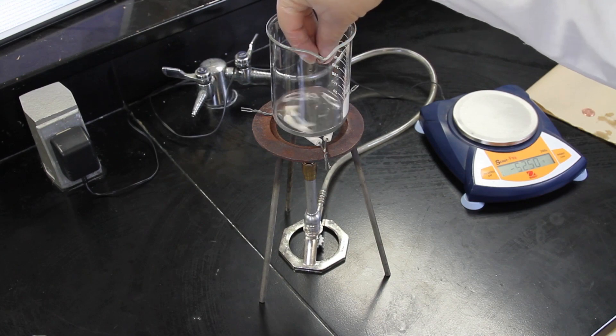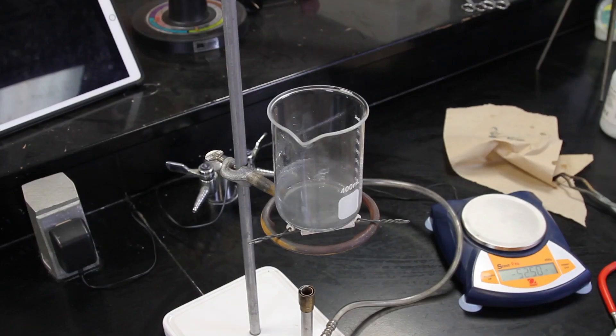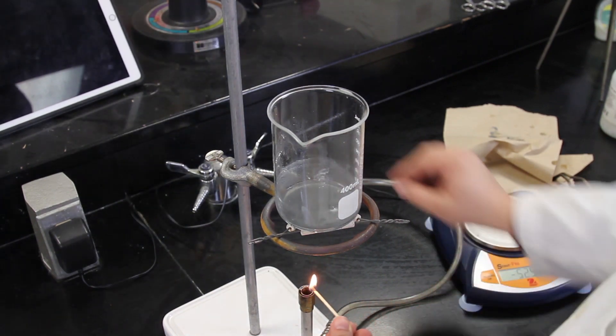Place 2 of the coins in the solution so that they are touching the zinc powder and completely covered with the solution. Heat the beaker on a hot plate at 200 degrees Celsius for 10 minutes or until the coins turn silver in color.